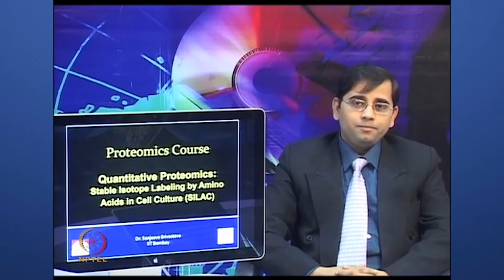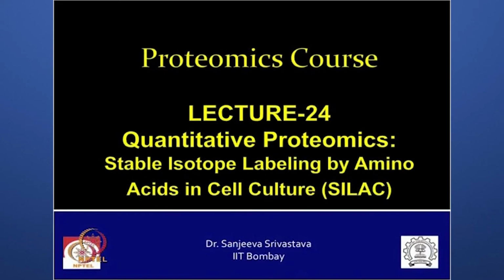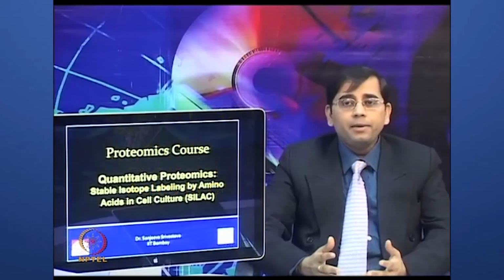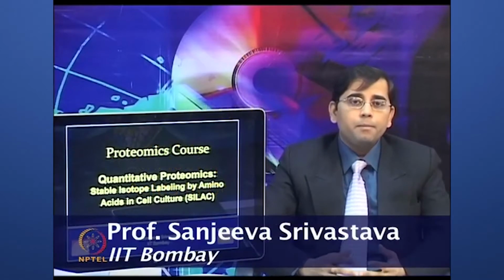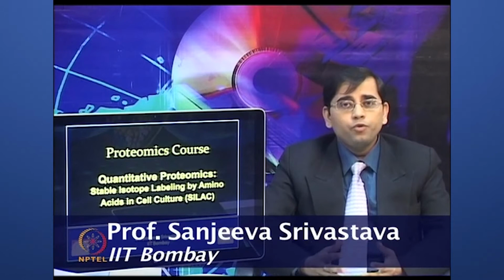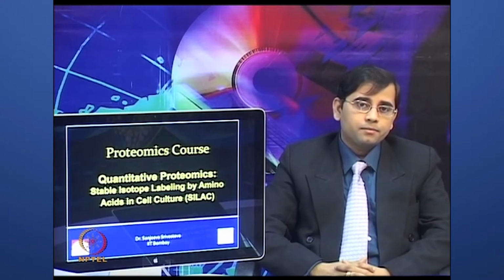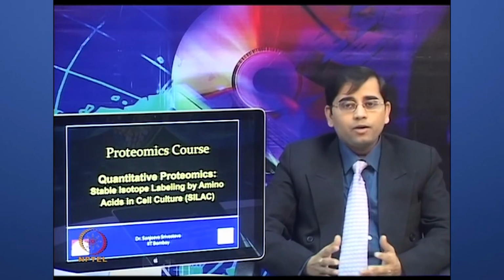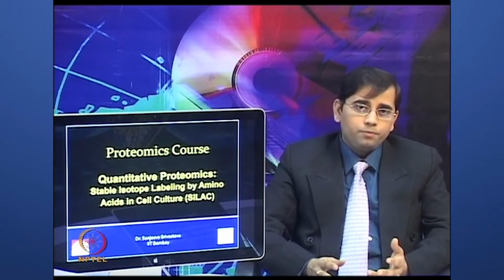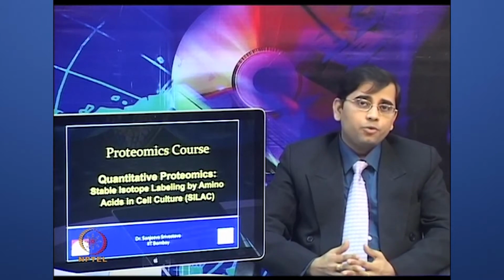Welcome to the Proteomics course. In today's lecture, we will talk about quantitative proteomics, the stable isotope labeling by amino acids in cell culture, SILAC. The complexity and dynamic nature of the proteome present major technological challenges. Mass spectrometry advancements have improved the high throughput identification and quantification of proteins. The mass spectrometers have advanced significantly and are now offering opportunities to understand human diseases and discover biomarkers.